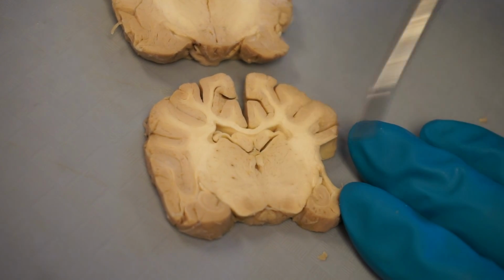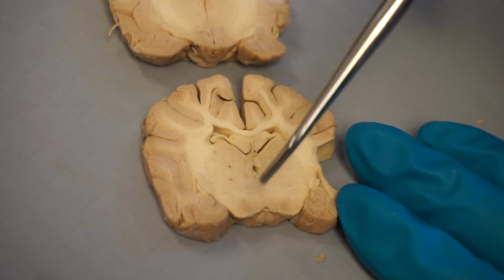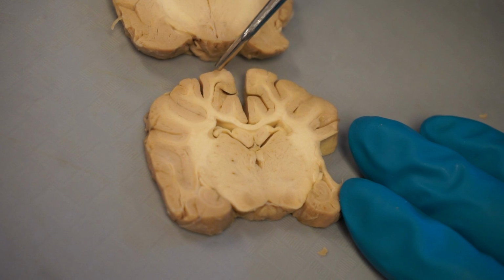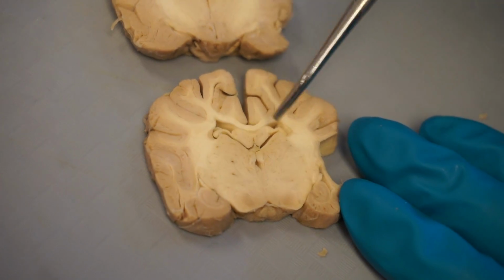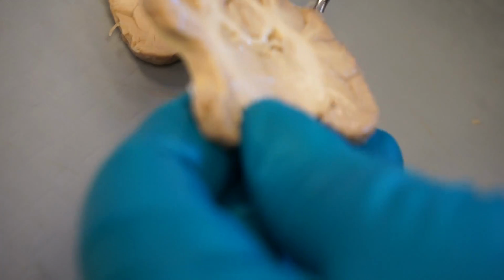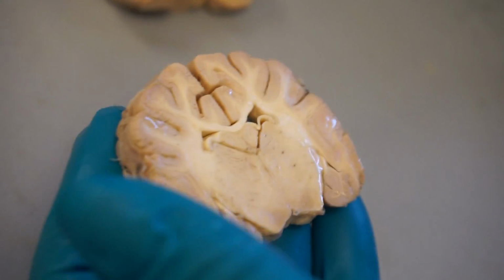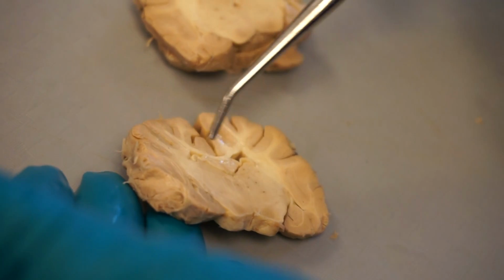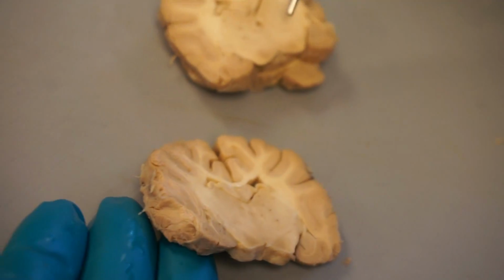So we know we have mesencephalon in this. We also have telencephalon and diencephalon. So that was the earlier section. Let me take you from, essentially, the same section that we just looked at.